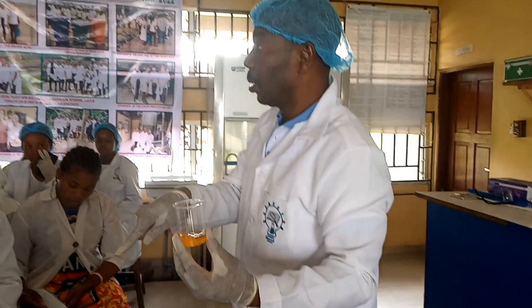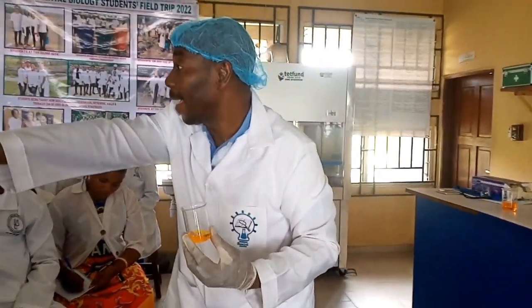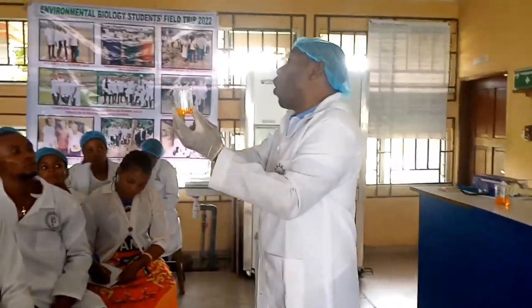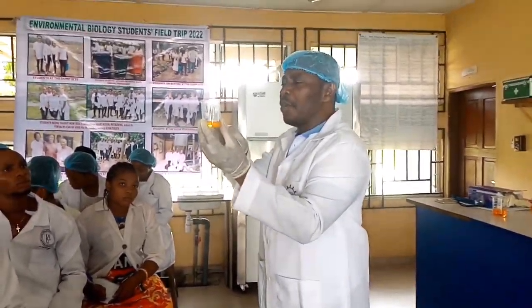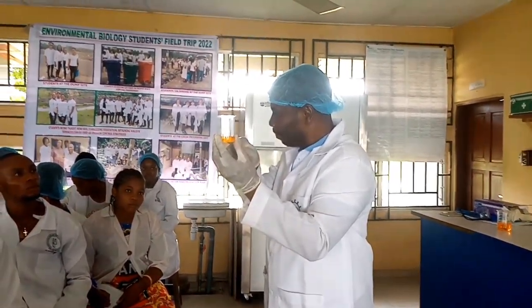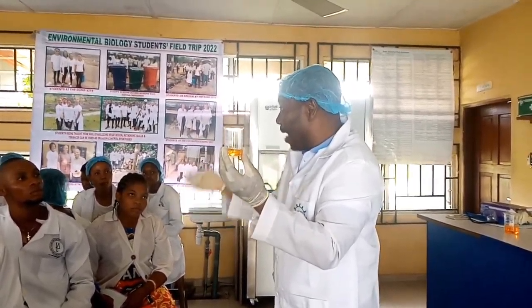If it is me, I don't need to do any calculation. I want to take equal volumes of a stock and water. You have reduced that from 5 to what? 2.5. Don't do calculation, 2.5. How many volume do you have there now? 2.5%, but what's the volume? 5. You know the volume now. We put 10 in and put another 10.